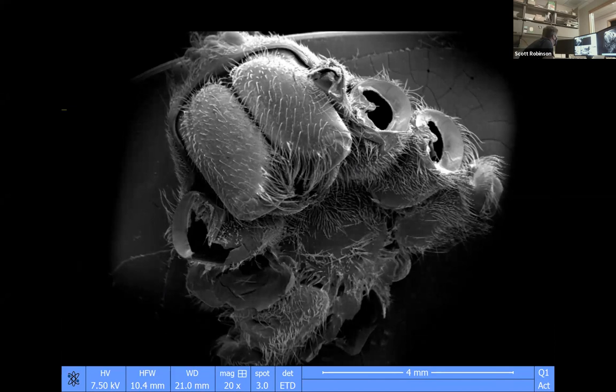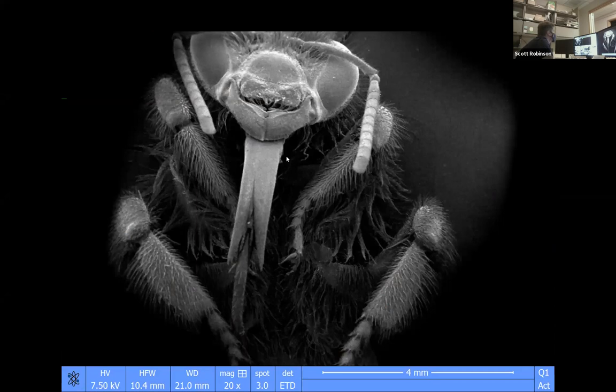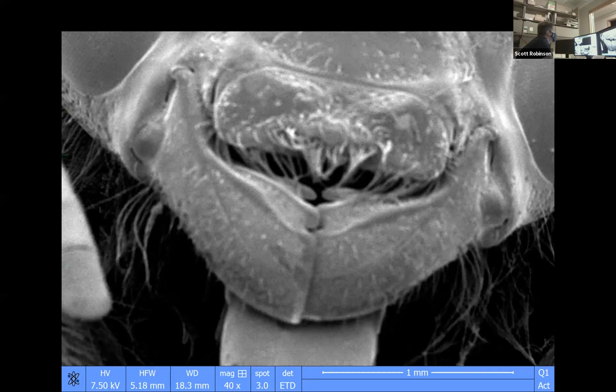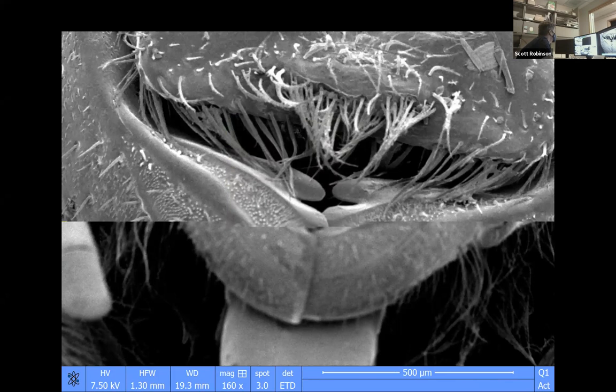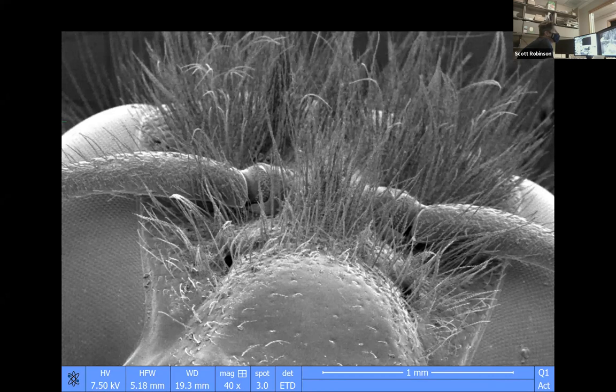So now we're gonna look at the coolest little honeybee. Totally chilling. Is it like a bumblebee to me in terms of how hairy it is? Is it a honeybee? It has forked setae. I thought it was a, and so we can tell that something is a bee, so I don't know for sure if it's a honeybee.